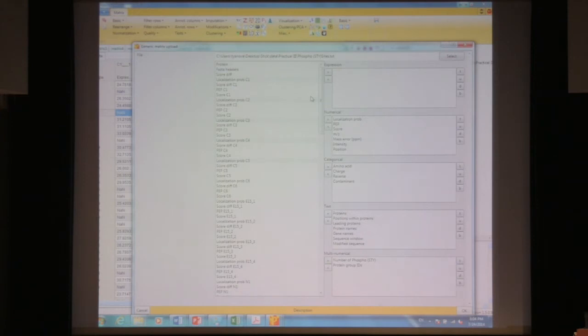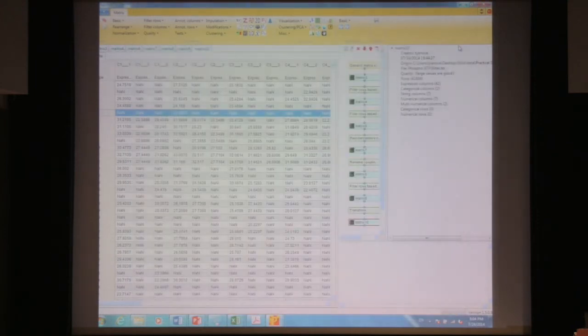Actually this is a site-centric table, and what you're seeing is you already filtered your class 1 sites here. And this has to be distinguished from the modified peptide table. It's a site-centric table, and you may have it quantified as singly phosphorylated, doubly or triply, but that information that you're talking about is sitting in the modified peptide table. You have to understand this. This is the site-centric table, which is giving you quantification on these different instances.